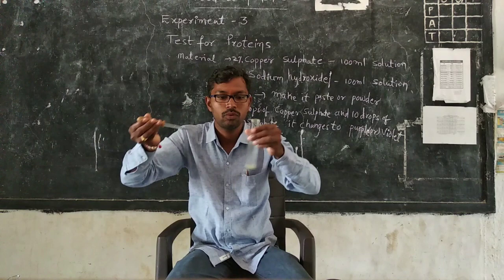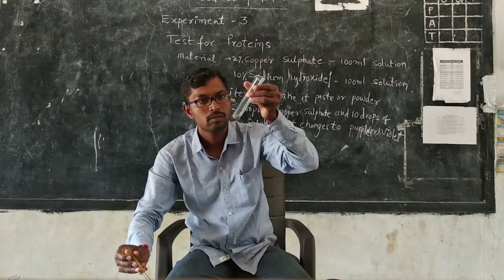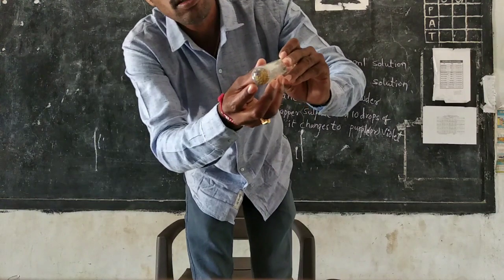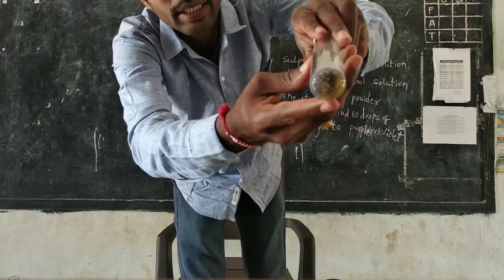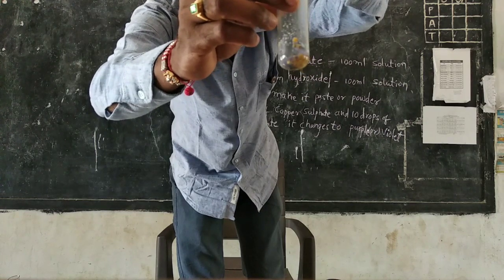Now we shake the test tube. When we shake it, the mixture turns to purple or violet color. This proves that the food item dal consists of proteins. I hope you have understood this experiment.